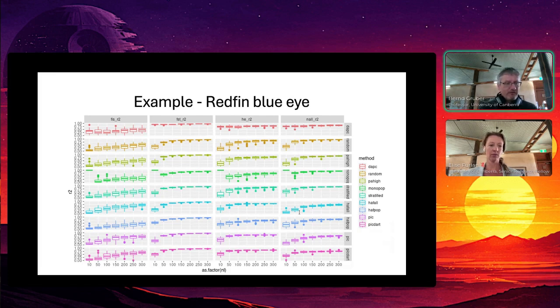And we compared, for example, the first row is a DAPC method. And you can see it performs beautifully for FST as predicted. It doesn't matter how many loci you're using. Obviously, with 300, you almost get everything back except for inbreeding coefficients. They're really hard to get back. So even 300 are not bringing back the original inbreeding values.